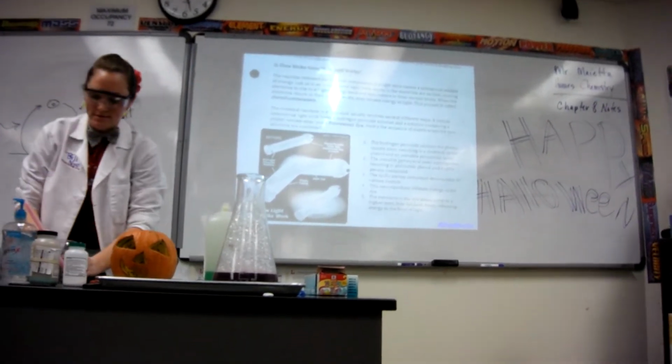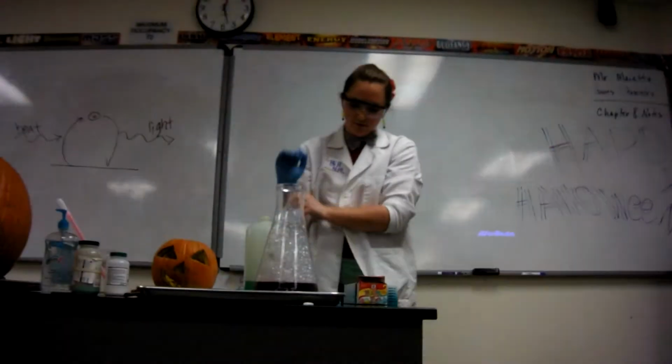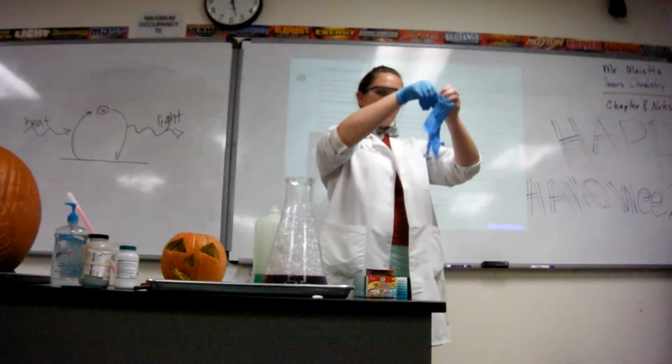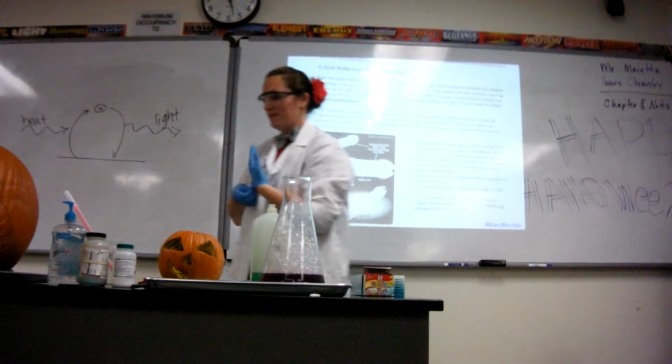Lights, please. Oh, let me put on gloves. Have you guys ever seen the show Firefly? Alright, so I'm going to break the glass and release the chemical into here. And I'll turn it. What, broken glass? Or this stuff? It's slightly toxic. Hey, it's going on my gloves.